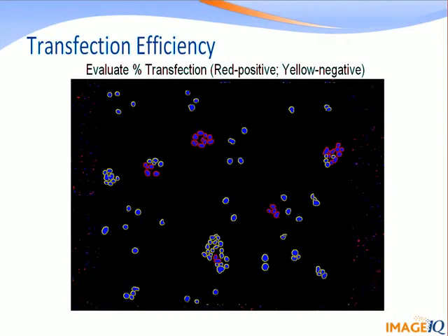And then this additional image, the pseudo-colored image, will allow you to confirm whether the numbers in the actual data match your visual assessment of the image.